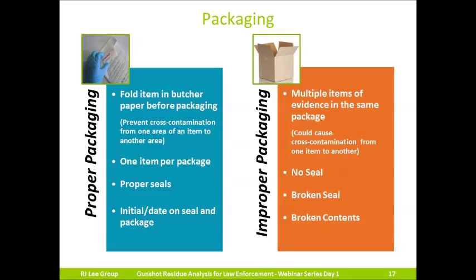When packaging clothing, items should be packaged in butcher paper prior to packaging. When multiple items are contained in one bag, cross-contamination can occur. Therefore, only one item should be placed in a bag. Now, this is important, especially if you have items that are coming from multiple people.